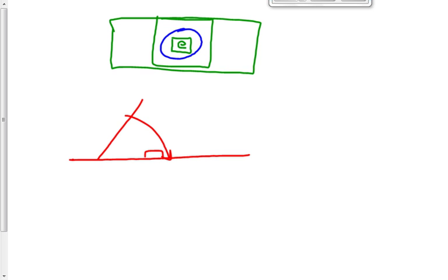When you put your slide in the microscope, make sure that the slide and the letter E are oriented this way. So if you're looking at the microscope, you slide it in so that it's right side up to you. It's not going to look that way in the microscope. Everybody follow? Draw the lab drawing as you see it through the microscope. If I see a right side up letter E, you're going to lose marks because that's not how it looks under the microscope.